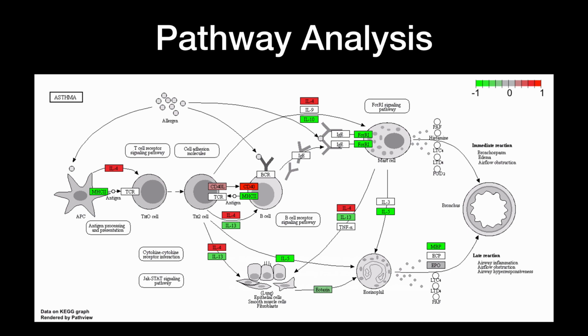And collectively then, when we put this all together, we can begin to get a rather detailed initial view of how airway inflammation can be perturbed with these types of steroids that we are analyzing in this week's lab. And we'll discuss some of the biology and some of the details here that were emerging from these experiments when we analyze this data together.